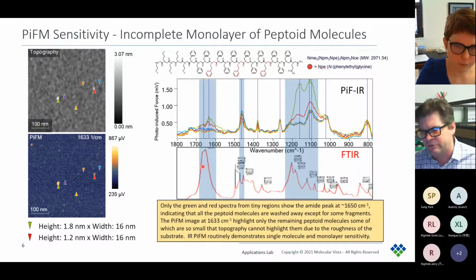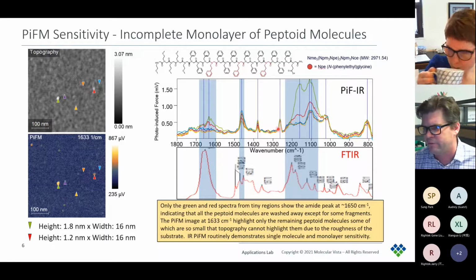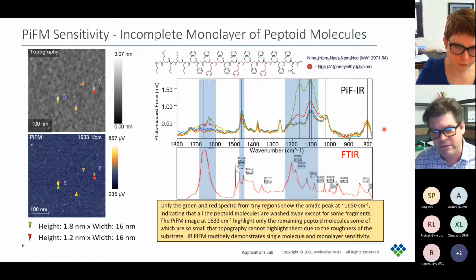And we are seeing that correlation. Now, you could ask, why are you seeing these other peaks here? So we have this peak around 1260. We have a peak around 1380. And then we have another peak down here in the 810 kind of region. So these we're finding are contaminants.